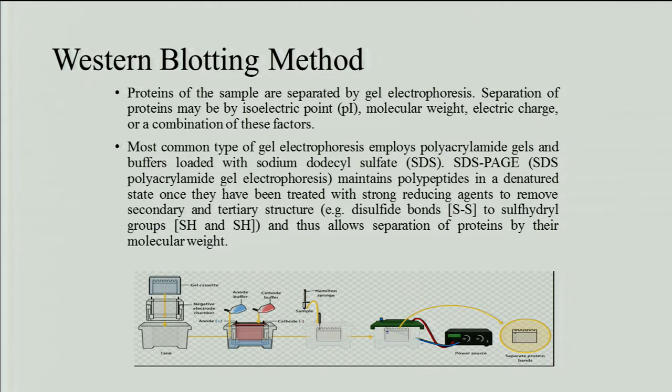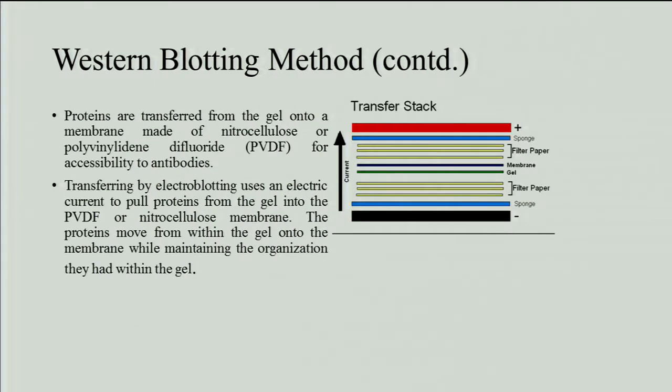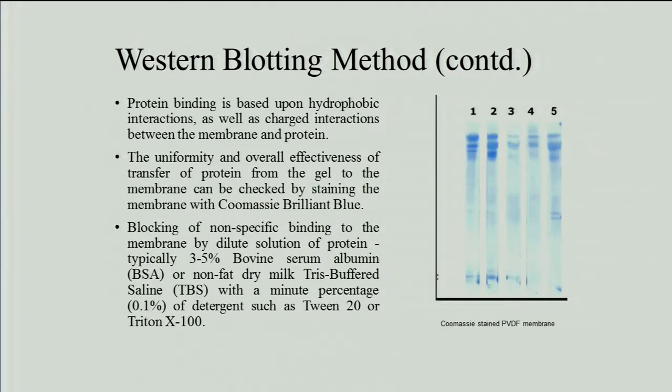Unlike DNA, which is one linear molecule, protein molecules can be two dimensional, so you cannot say how it will behave. You use a similar method, but you can differentiate among their weight or charges. The gel electrophoresis method still works because it is diffusing and diffusion depends upon the mass. A larger protein has a larger mass and moves slowly, and that is how you differentiate.